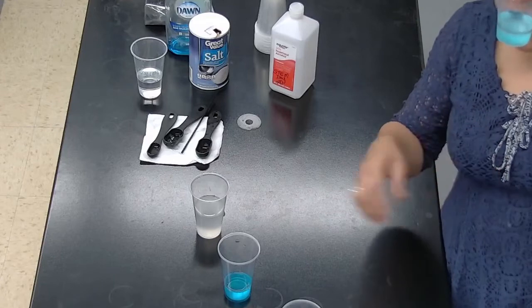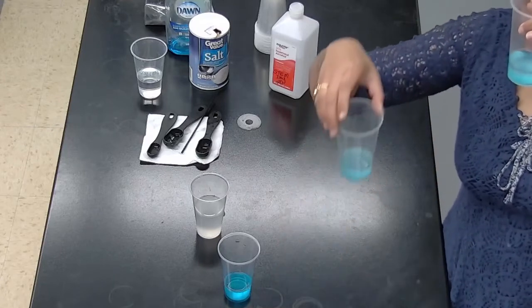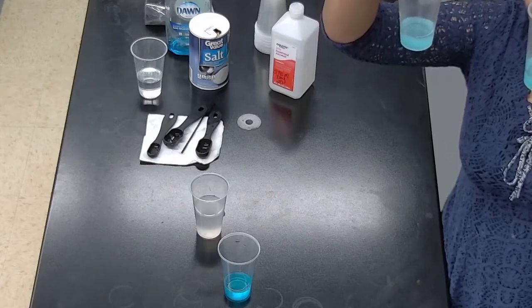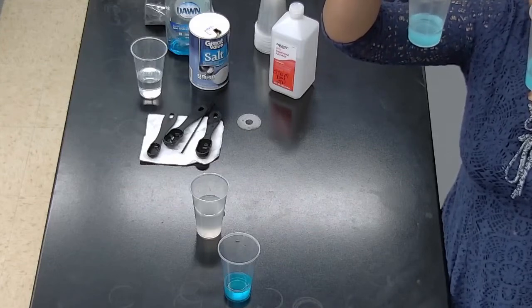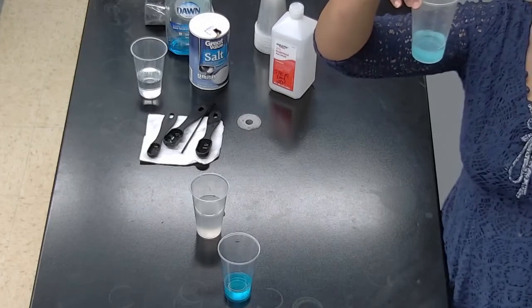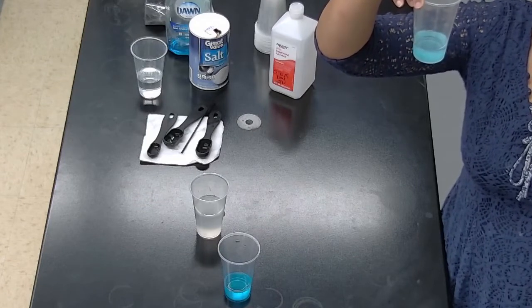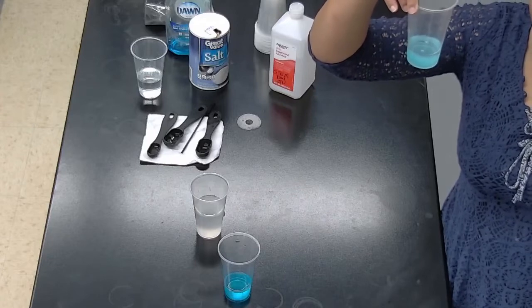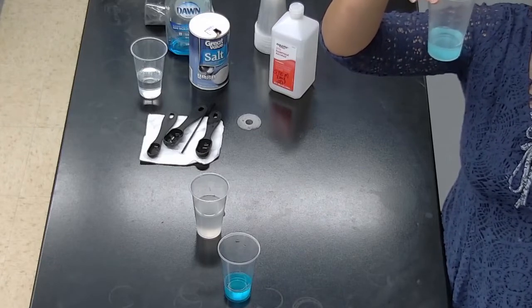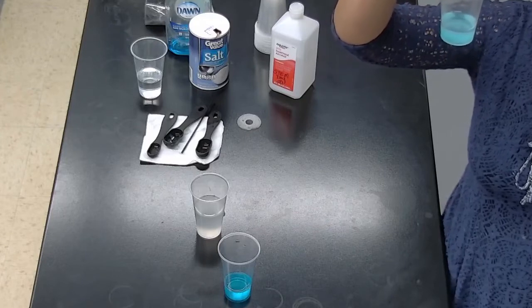If we compare, this one has just started getting the bubbles. The DNA is associated with the bubbles. It's coming out, it's separating. It will take some time to separate. And this one has been sitting there for around 5 minutes, so you can see the difference between these two. It has a lot more DNA than this one.